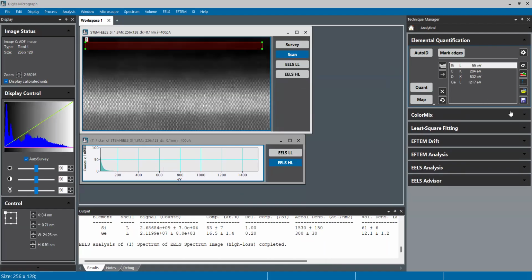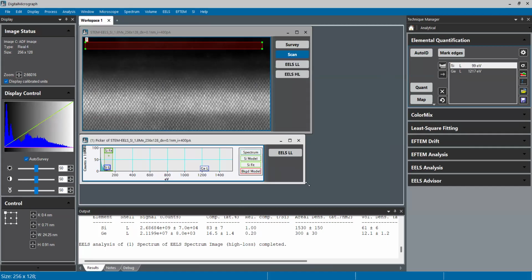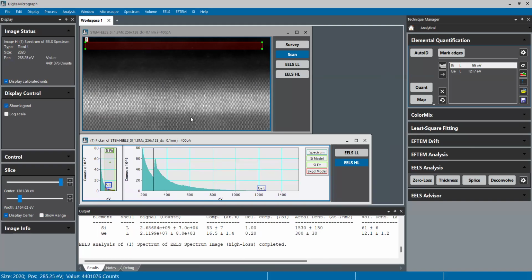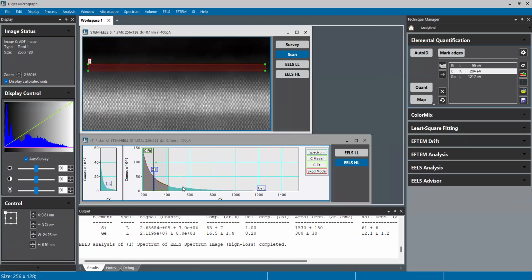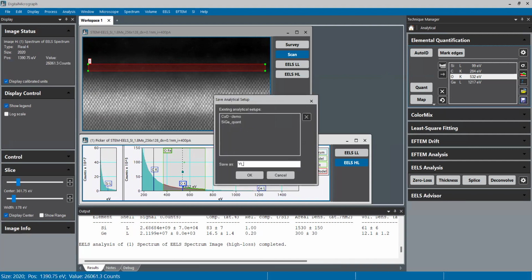It is showing these, because I don't know what I did with the germanium and the silicon. So actually I'm going to clear these, and I'm going to open up this one, and I'm going to add in the carbon and oxygen to those, like we saw earlier. Okay, and I'm going to save this now. So this will be YouTube tutorial.